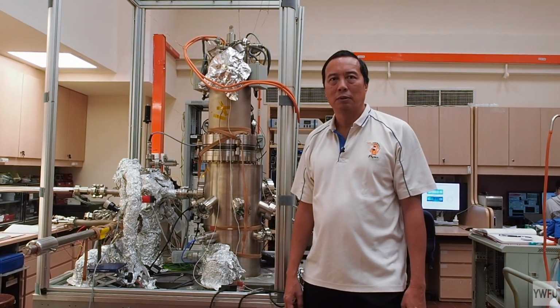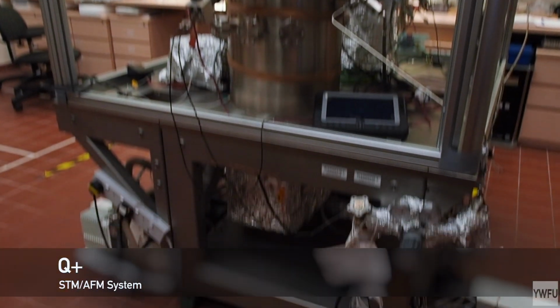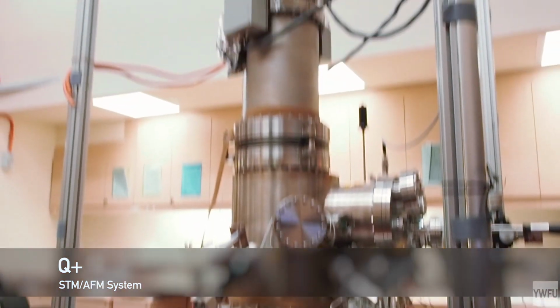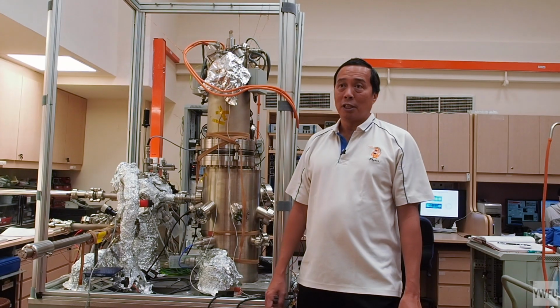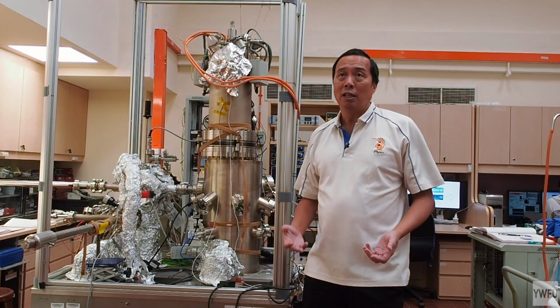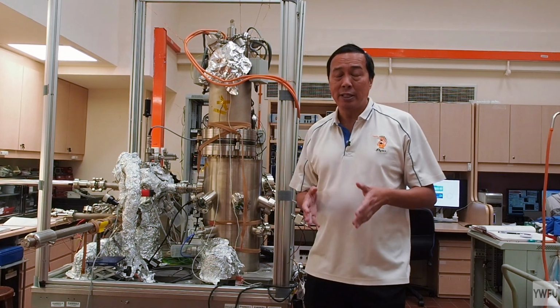So remember that just now you mentioned that the machine can do both AFM and STM. And from what we see earlier, the AFM image resolution is a lot finer than the STM. So why don't we just use AFM all the way? Yes. This refinement of the AFM technique in recent years, or the Q plus AFM, is much more complex than STM.